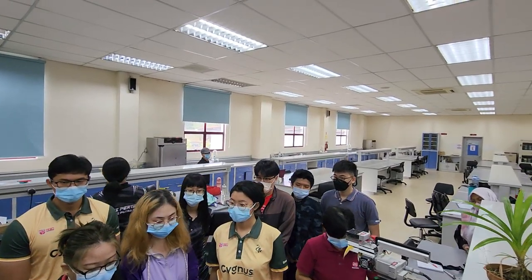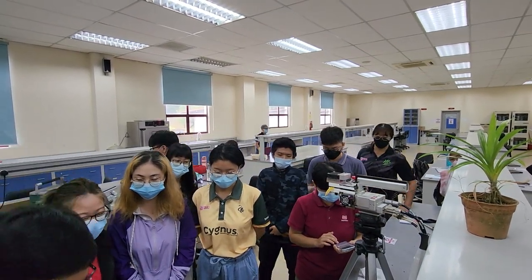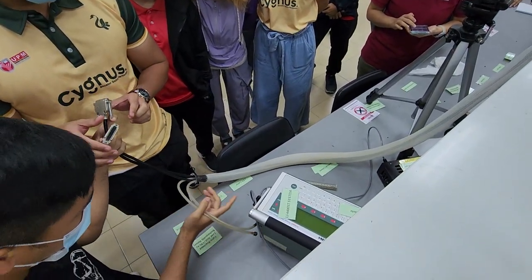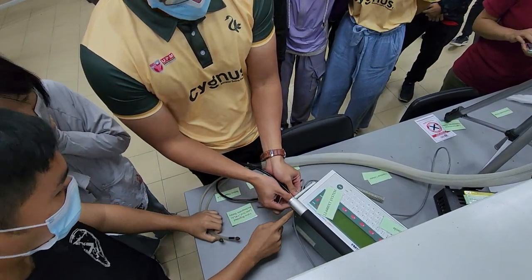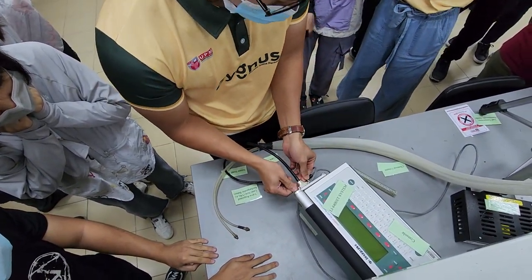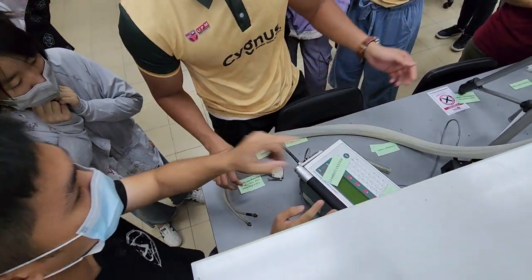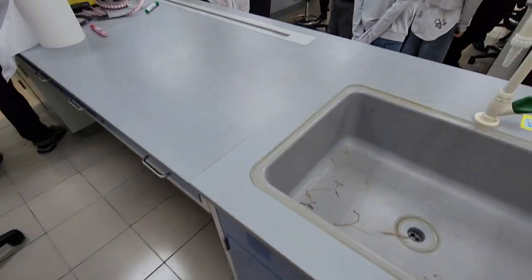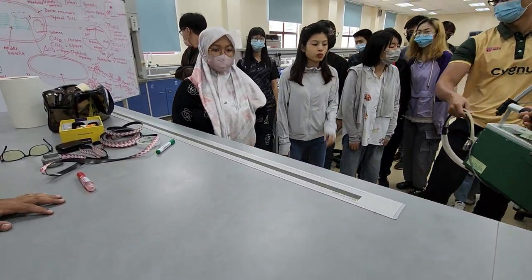Okay, so I need one volunteer. I will guide you, then you fix everything. You. Okay. So just now, we already know for this cable, we have female and male. So now please attach the cables to the console. So which one is male? This one is male. So this one, I will go to the female plug. Yeah, you have to tighten it up. Maybe you should bring it over here.